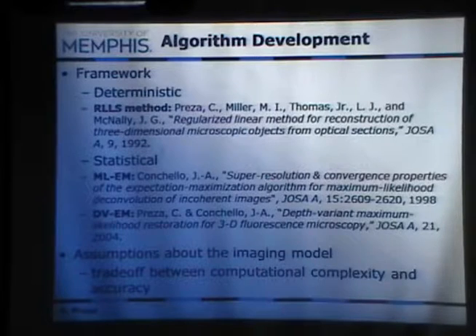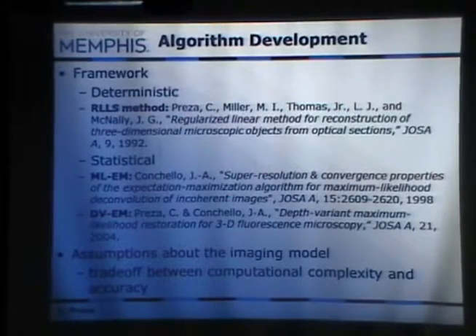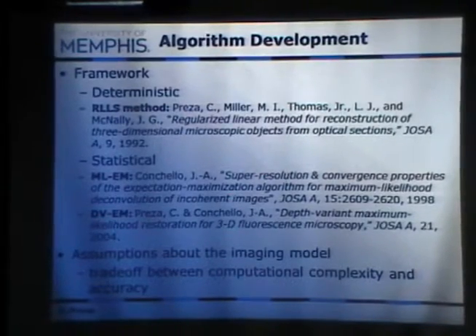But, okay, so again, there are trade-offs here. So these are iterative methods. This is non-iterative. So one iteration of this algorithm here takes as long as it takes to execute this algorithm, right? So there is a difference in the computation time, because this algorithm, you may need to execute tens or hundreds or thousands of iterations. So what's the size of the system you have to invert, for example, from the first method?